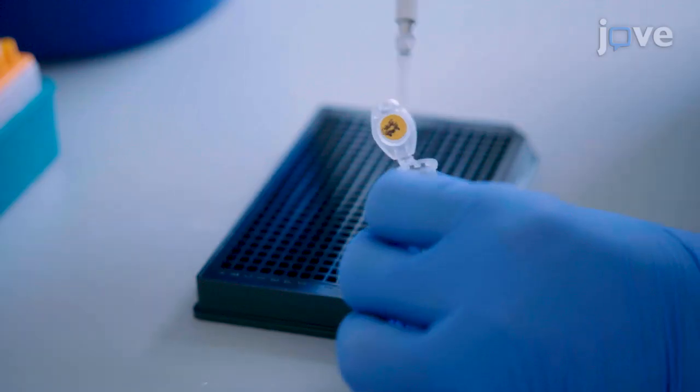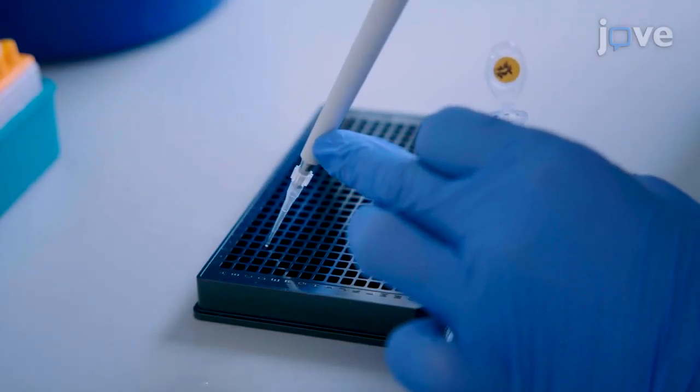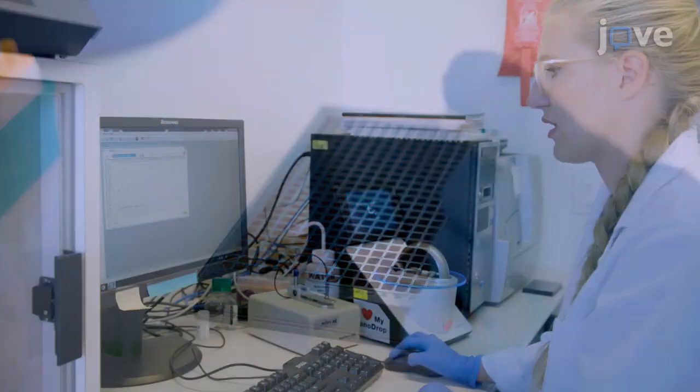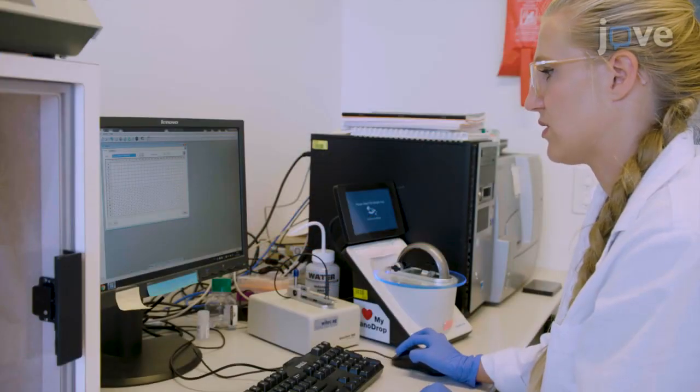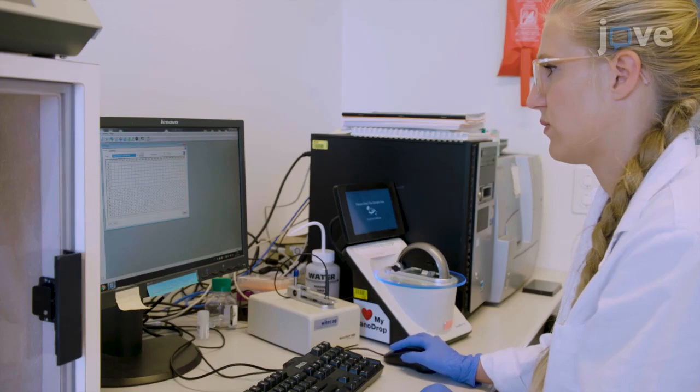The Bonn-Pot method has proved to be not only cost effective, but also time efficient. It cuts down the preparation times from several weeks to three working days. This makes the PURE cell-free platform accessible to more laboratories worldwide and helps to implement this powerful platform for synthetic cell-free biology.